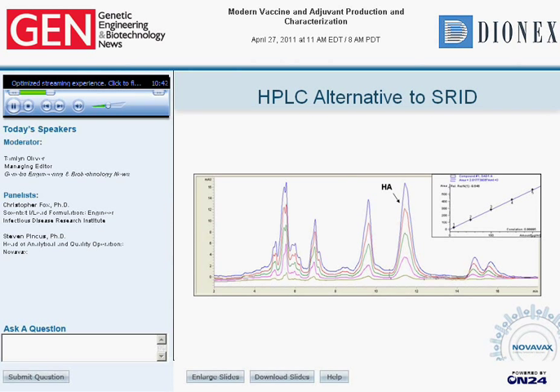Some of the other peaks we are also in the process of identifying. And as you can see, it's a very powerful technique for quantitating the amount of protein and determining the types of proteins that are in our virus-like particle vaccine. Next subject is purity. The HPLC profile that I just showed you is one way that we look at purity, but again, trying to identify all the proteins in an HPLC profile is quite challenging. So we still go back to some of the more classical techniques.